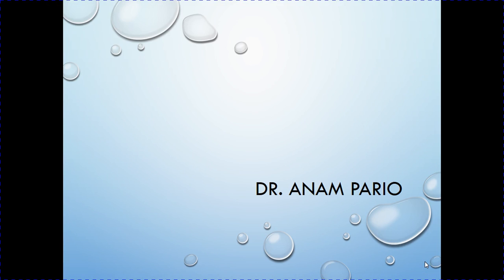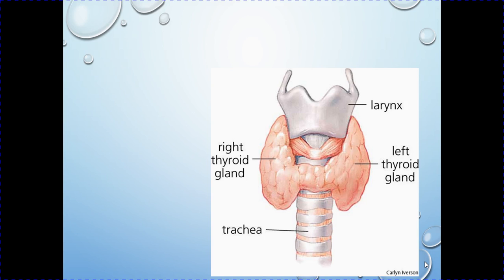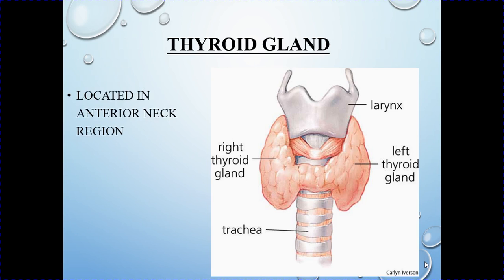I'm Dr. Anampario and we are going to learn the histology of thyroid gland. Now you know that thyroid gland is a major endocrine gland which is controlling the metabolic activities of our body.